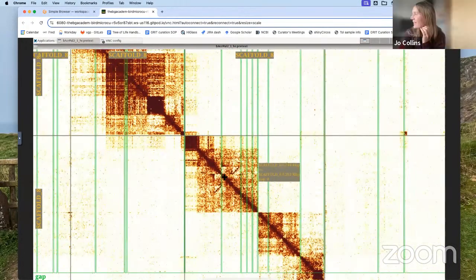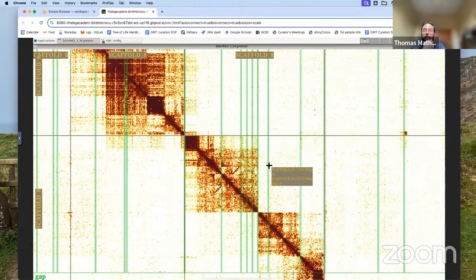Can you just clarify if this assembly that we're looking at, is this our HiFi assembly, or the ONT assembly at the moment? Yeah, so this is a nanopore assembly. Somebody was just asking if it's ONT only. So I think this one was ONT only. The chicken one that was published was a mixture of HiFi and ONT, but this one was a de novo ONT only assembly. I think this one came in through ERGA originally, from the ERGA pilot project, and there were some of the labs there doing nanopore only assemblies. So yeah, it's a nanopore assembly only.